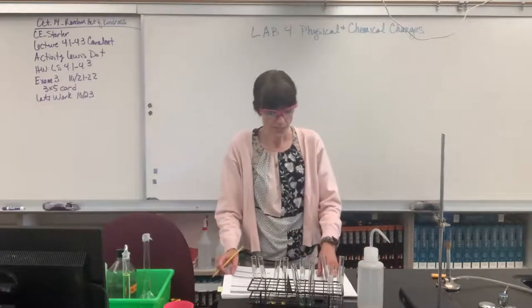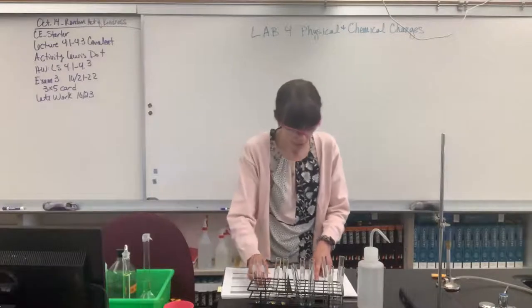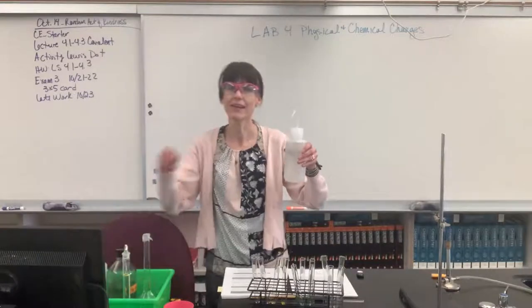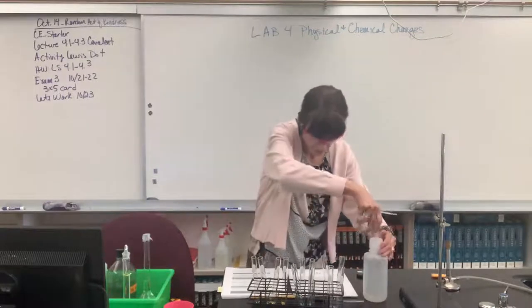Number four, it says test the remaining solid in the test tube as follows. Add 20 drops of distilled water and agitate the tube. So let's take my distilled water. Here's my distilled water and I have a dropper. I'm going to go ahead and open this up and we're going to count 20 drops of water.